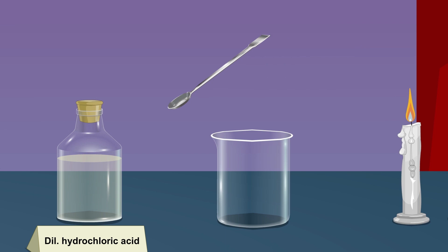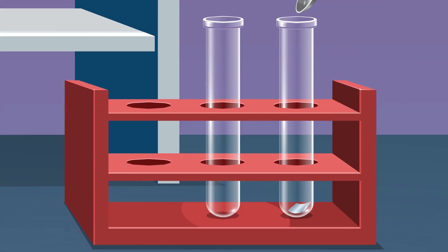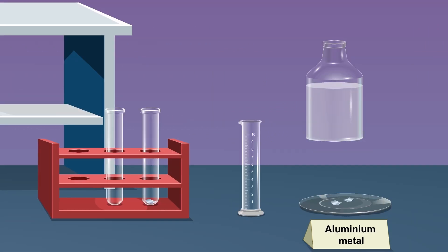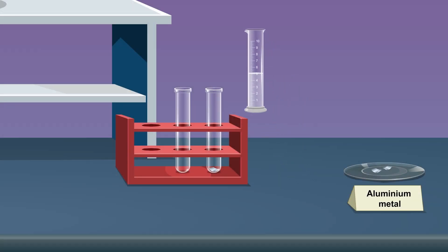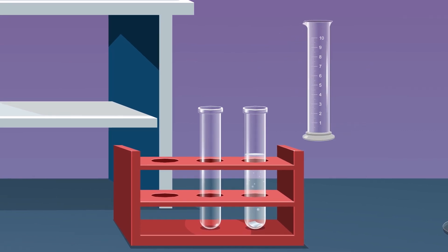Reaction with aluminium metal — procedure: Take a small piece of aluminium metal using a spatula and put the aluminium metal into the test tube placed in the test tube stand. Take about 5 ml sodium hydroxide solution in a measuring cylinder and pour it into the test tube containing aluminium metal.